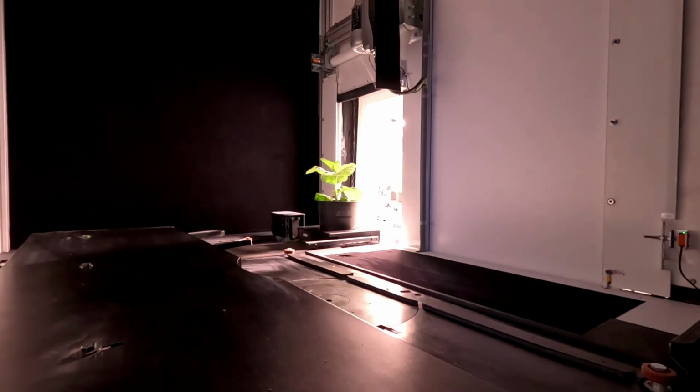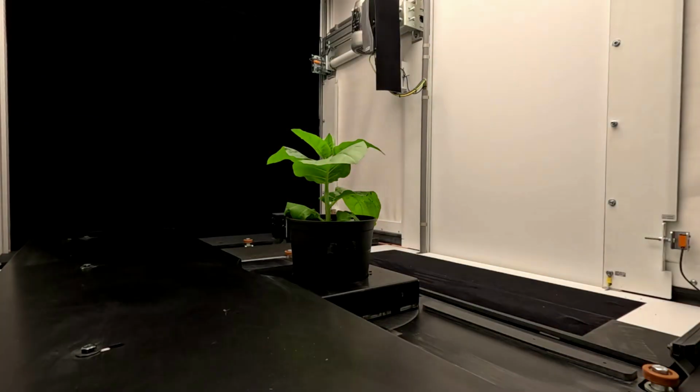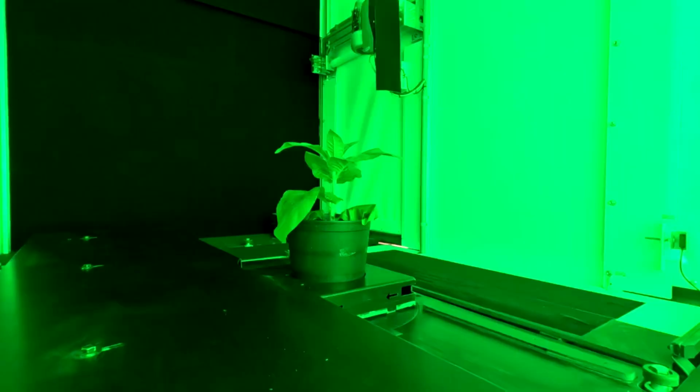The automation ensures that image acquisition is consistent for each plant in the set. Turning the plant in front of the camera enables multi-view phenotyping.